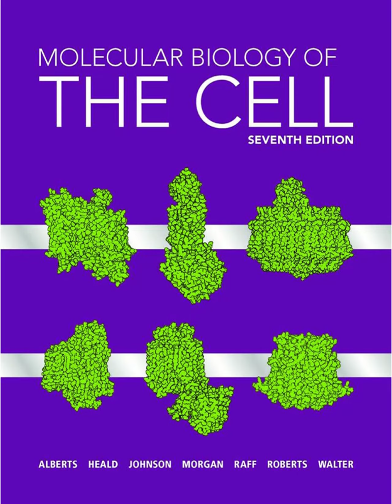Not always, especially if the target protein isn't very abundant. So often researchers use indirect immunocytochemistry. How does that work? You use two antibodies. First, an unlabeled primary antibody made in, say, a rabbit that binds to your protein of interest. Then you add a secondary antibody that's labeled with a fluorescent dye and is designed to recognize any antibody made in a rabbit.